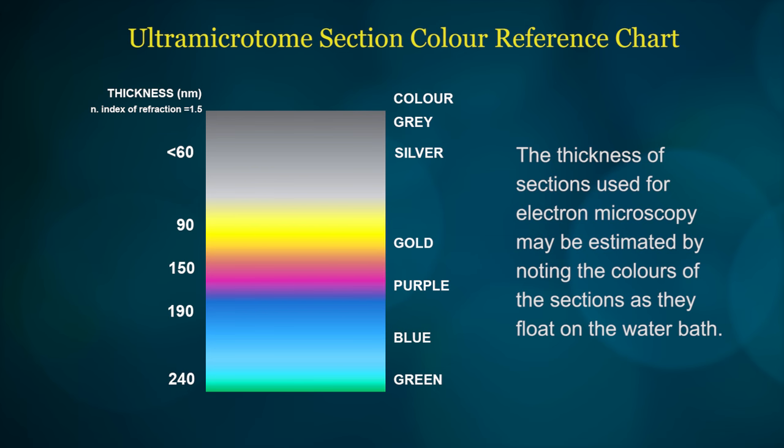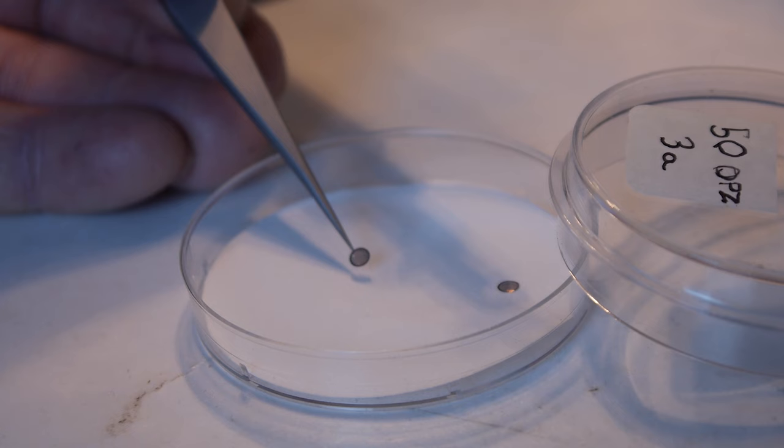Compression in the sections is removed by using chloroform vapor. Note the color changes as the sections stretch out. The chart shows the thickness of the different colored sections. Only the silver to gold colored sections are suitable for electron microscopy. They are 70 to 90 nanometers thick.